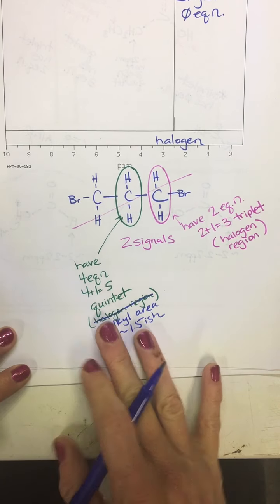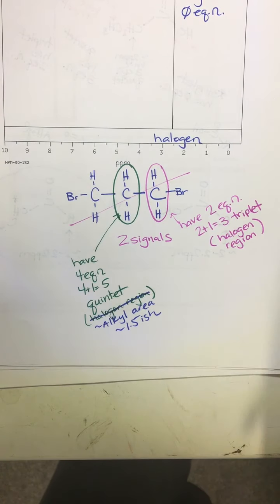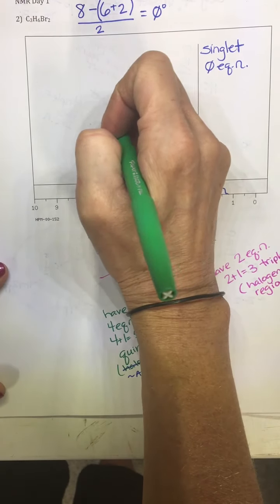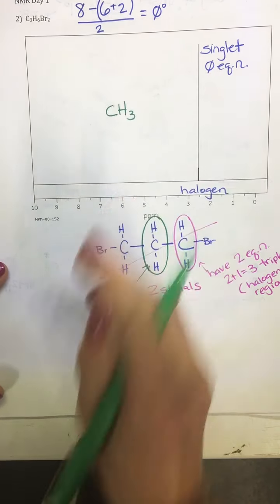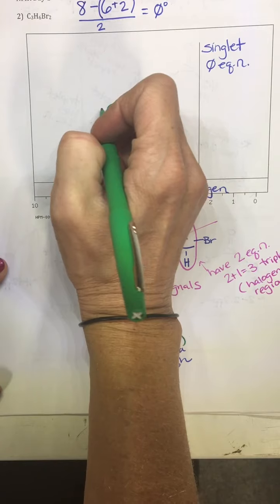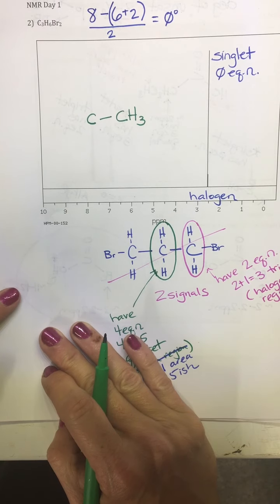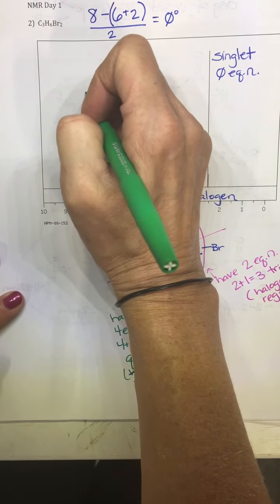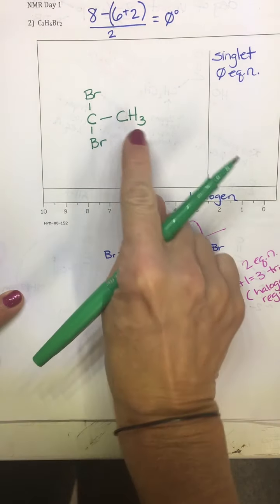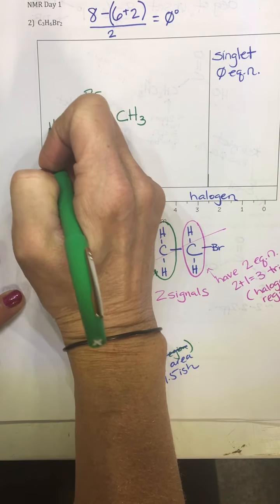So right now this doesn't match, so we can't do the CH2s. So how about if we make something symmetrical with 2 CH3 groups, right? So if I have a CH3 group here, and I want to say these hydrogens can't have any neighbors. So if I attach a carbon right here, I can't put any hydrogens on it. So what else do we have? We have our bromines. So let me put our bromines right there. That will eliminate the possibility of these guys having any hydrogen neighbors. And then our very last carbon would be right here.